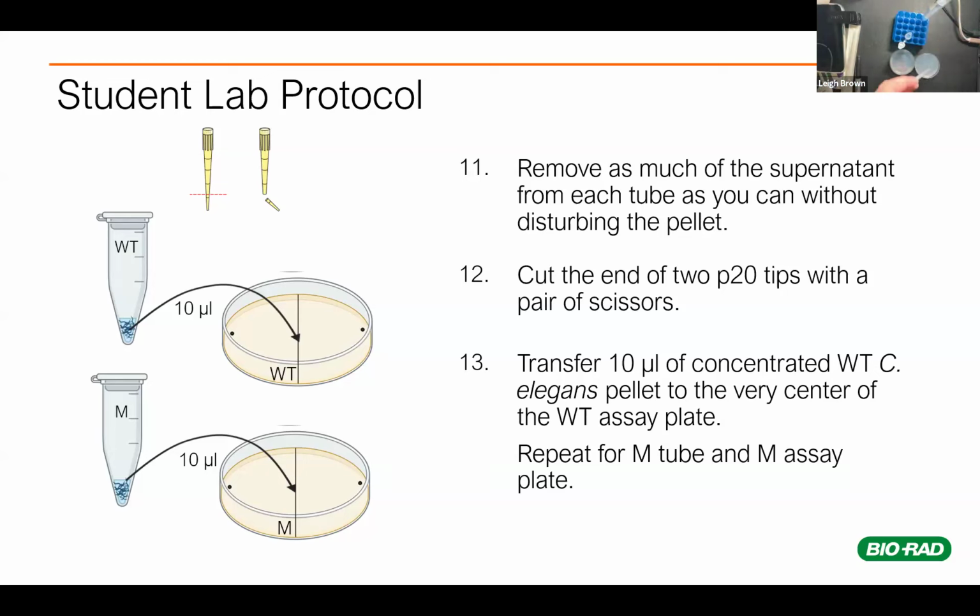One thing you can build in as they're working with the worms previous to this is have them throw worms underneath a microscope if you've got dissecting scopes around, so they can get familiar with what the worms look like. If you really don't like a student, you could have them look for male worms, which are like 0.05% of the population usually. I've yet to see a male that I'm aware of, at least. I saw one years ago at Rocky Canyon High School in Colorado. I was very, very surprised. But we'll show you a diagram of what a male looks like a little later on here.